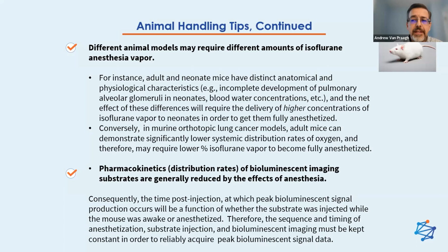So the simple point to be made here is that whatever technique you develop, injection followed by anesthesia, anesthesia followed by injection, you always want to maintain a consistent routine, because your peak kinetics for the distribution of the D-luciferin to the luciferase enzyme expressing cell populations will be dependent on it. And you will get peak signal at different time points based on the order in which you do the injection followed by the anesthesia or vice versa.